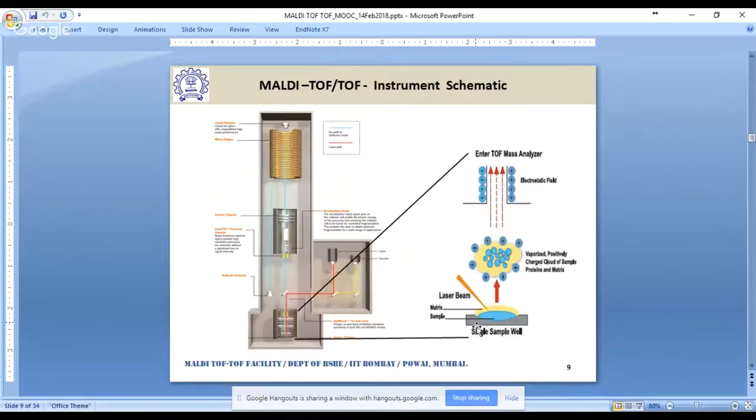If the expected molecular weight of the samples is more than 5 kilodaltons, then the ions that are generated are big enough to be separated in this path length and can easily be detected by the detector at the top of the instrument.